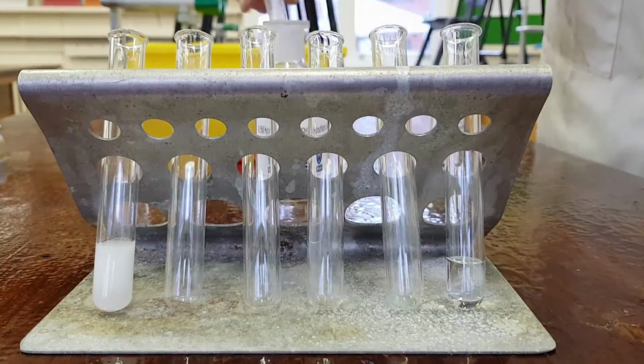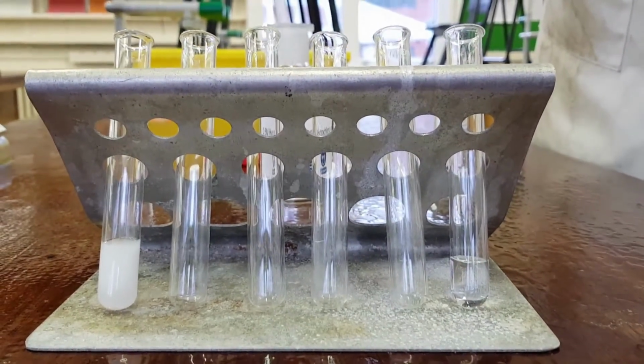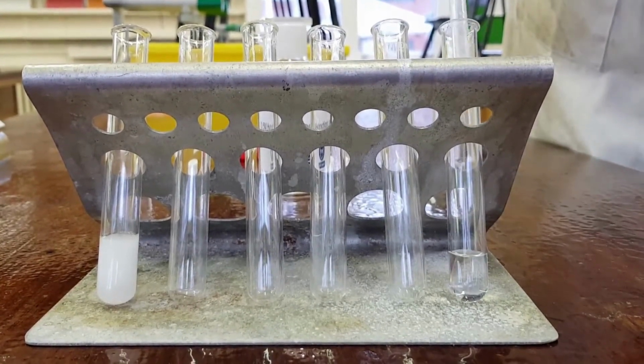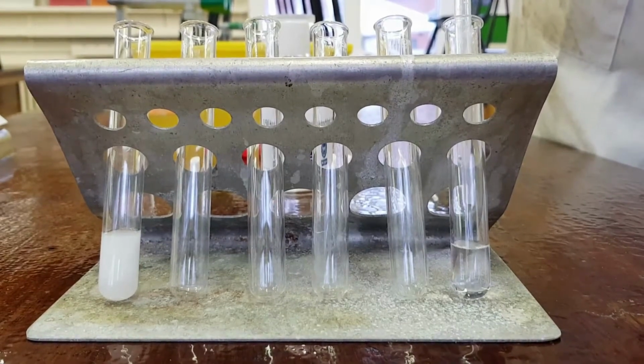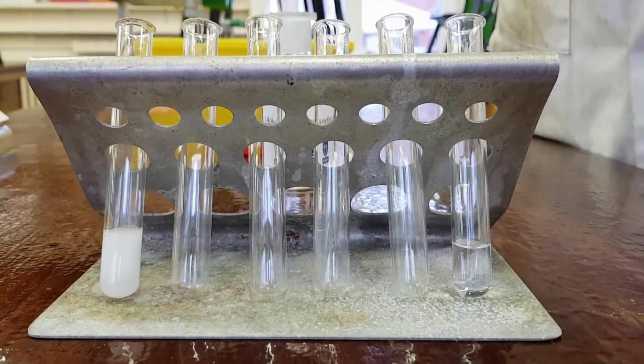You don't need to go overboard with this. A centimetre's depth is more than enough. Now we're going to add some hydrochloric acid to this. And that's just to remove the impurities. Have a think, which acids wouldn't be sensible for use in this test?